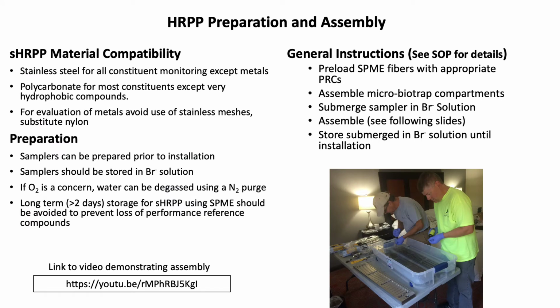The focus of this presentation is really less on the abilities of the sampler, which were just quickly reviewed, and more on how to actually use the samplers: their preparation, their assembly, and how they're sampled. The remaining slides are going to go through those areas in detail. To support this discussion and these slides, I want to draw your attention to a video that is available on YouTube, which demonstrates the assembly of the samplers, which can be used as a reference for anyone that would like to utilize these and supports this presentation with more detail.